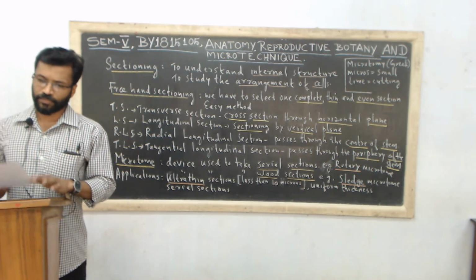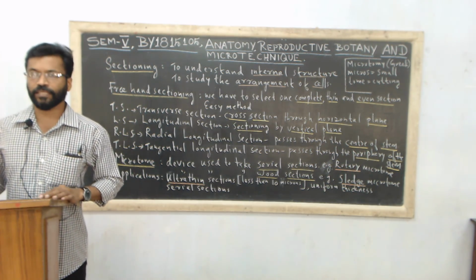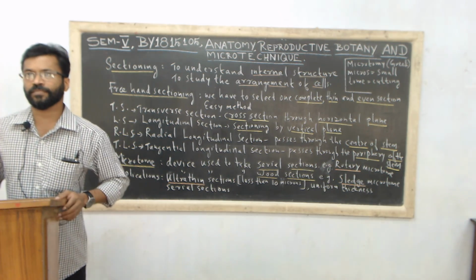And these are all about the sectioning techniques in microtechniques. The next session deals with the staining techniques.